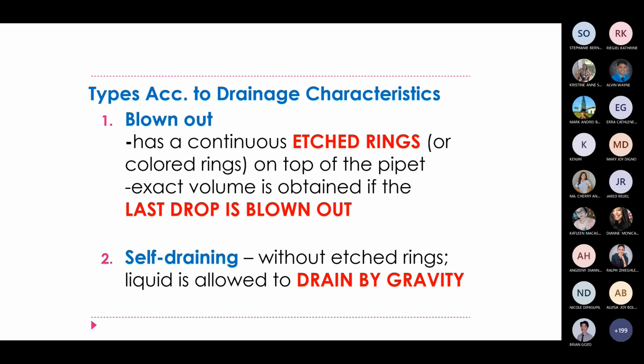Letter H. Blow-out has continuous etched rings. Okay, the exact volume is obtained if the last drop is blown out. Ayan na, hindi n'yo na makakalimutan, di ba?